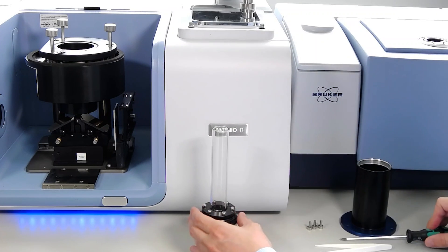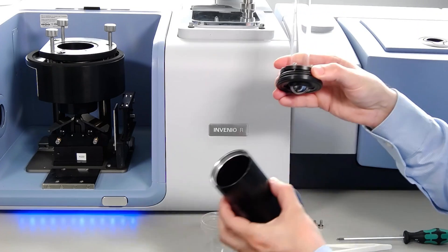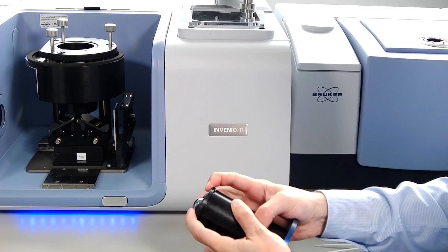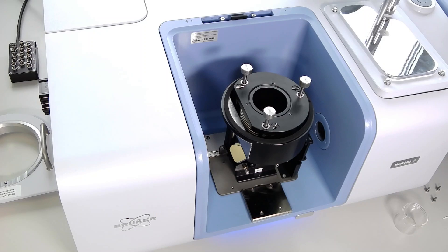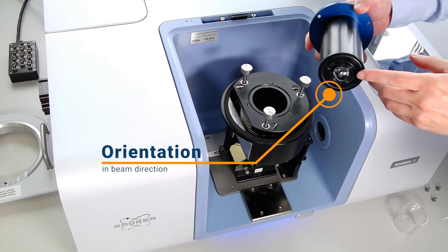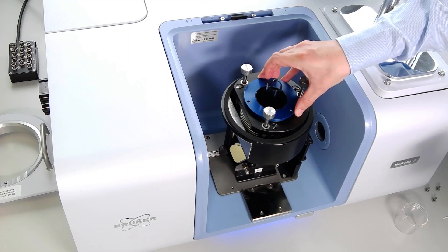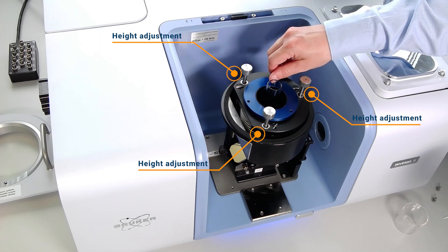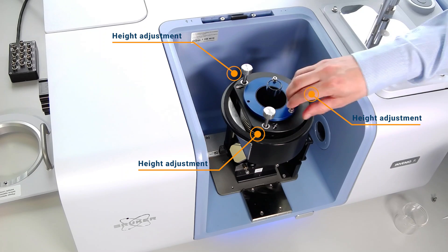Finally, the crystal window plate is installed into the aluminum tube for insertion into the reflection unit. Care has to be taken that the beam openings in the bottom plate are oriented in the same direction as the beam path. The electrochemical cell insert is fixed with three screws at the top. In addition, there are three further alignment screws on top which can be used to control the height of the complete electrochemical cell insert.